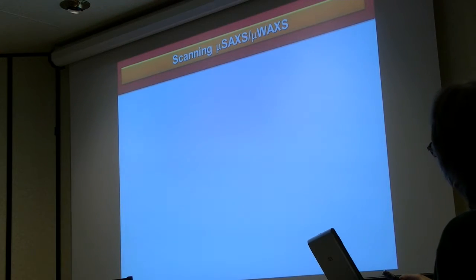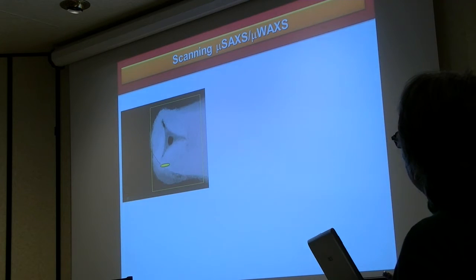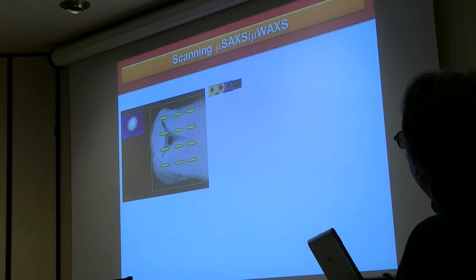And this is just to show you how the technique works. You have a mesh on your sample.